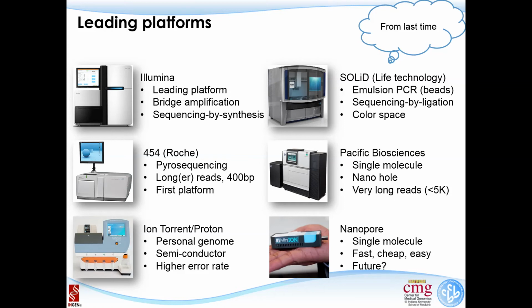Also, this is single molecule sequencing. What single molecule means is that you do not need to do the amplification to do the sequencing, in the sense that you don't need to make one tree become a forest. But how can they collect enough information? For this technology, they do not need the nucleotide to give the light.